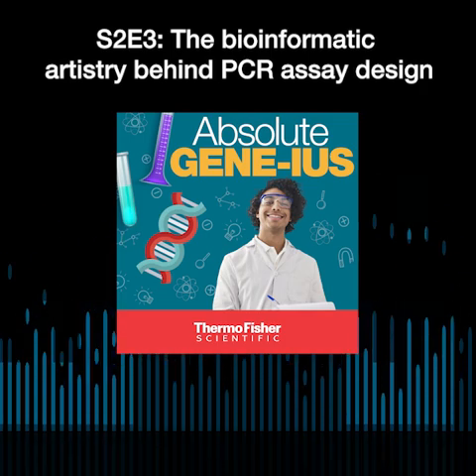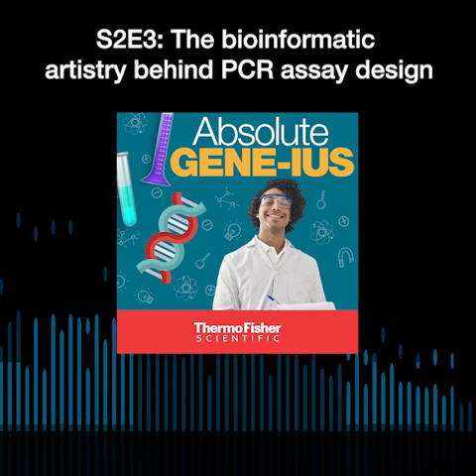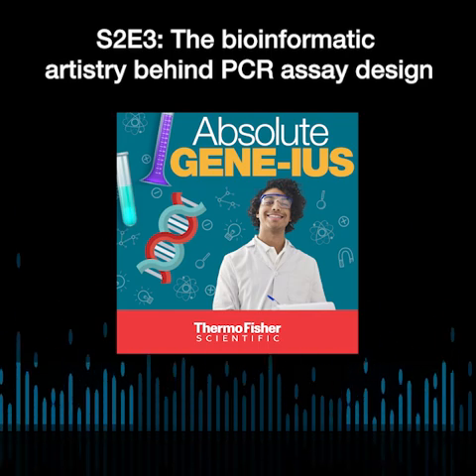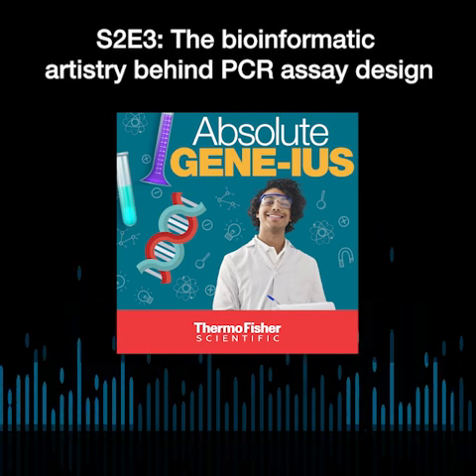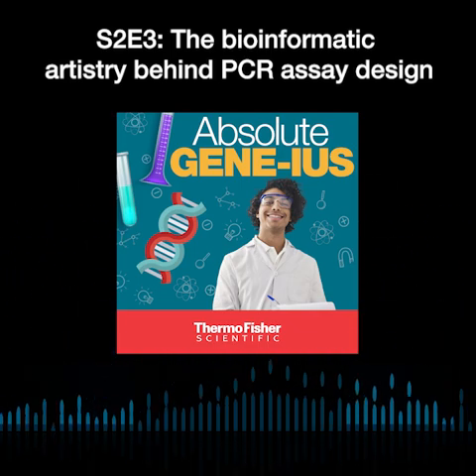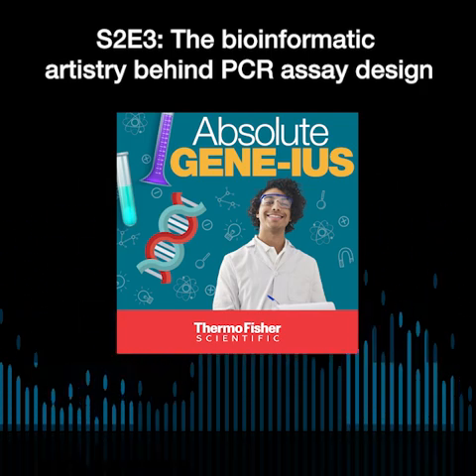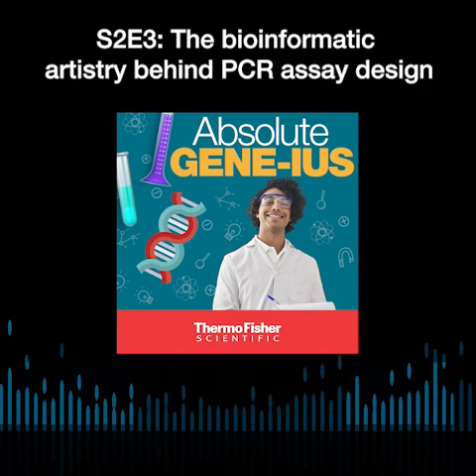And I can imagine, it can be difficult enough sometimes designing primers and probes for one target on one species, but if you throw in 2, 3, or 4 targets and multiple species, if you're looking at an environmental sample per se, now you've exponentially increased potential pseudogenes and potential non-specific binding, and I can just imagine the difficulties that can happen, even when on a computer it looks like you have some good primers, probes, and targets identified.